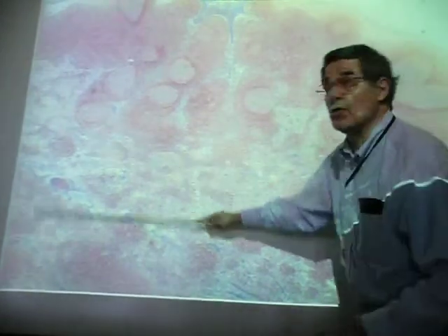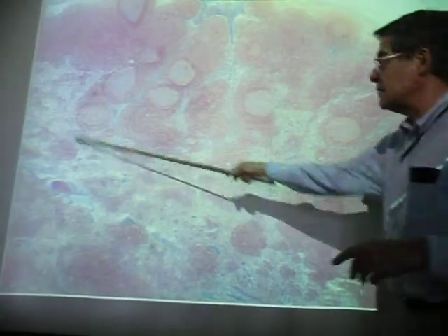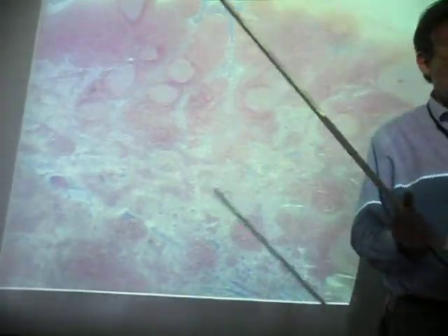And if you look at it, the cortex is much denser. You can see it here very nicely. It is much denser than the interior, the medulla. So this is all cortex out here. You can see all these follicles. And here's the medulla. It's much more diffuse because this is where the sinuses are. The medullary sinuses, and then the purple tissue here, that'd be the medullary cords.